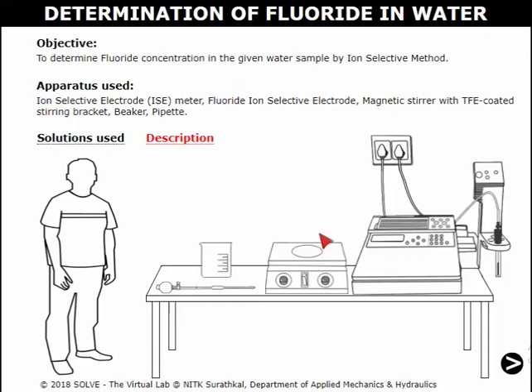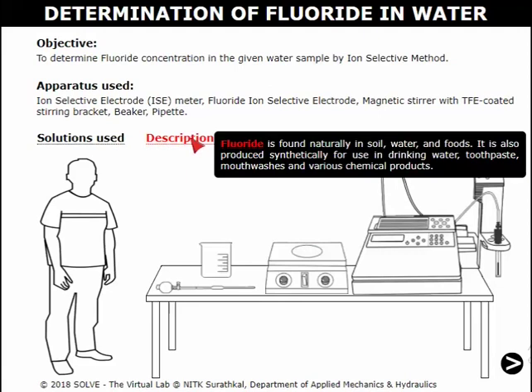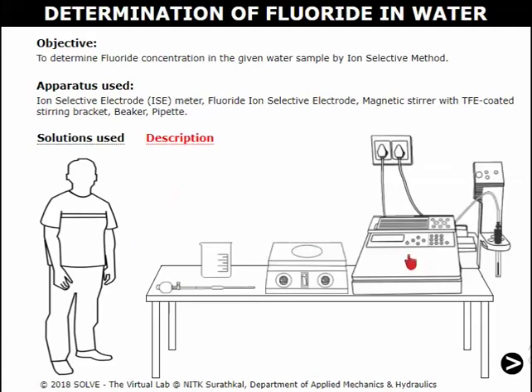Welcome to Lagupata from Sol, the virtual labs. The objective of this simulation is to determine fluoride concentration in the given water sample by ion selective method. To know about the reagents used in the experiment, click on 'Solution Used'. To understand the terminologies, click on 'Description'. The setup used for this simulation is shown here. Throughout the simulation, to proceed to the next step, click on the arrow shown below.